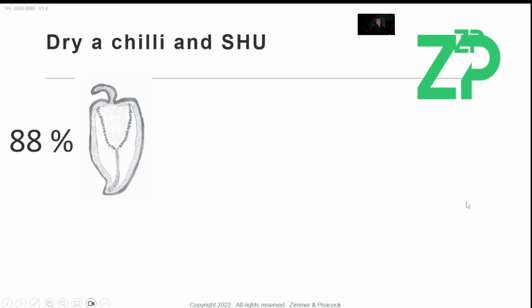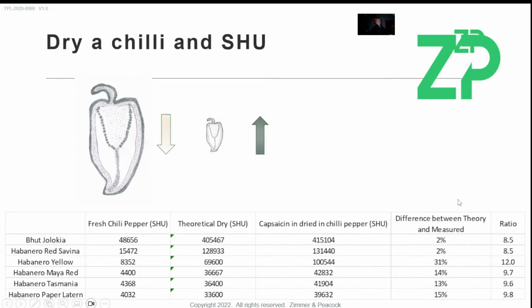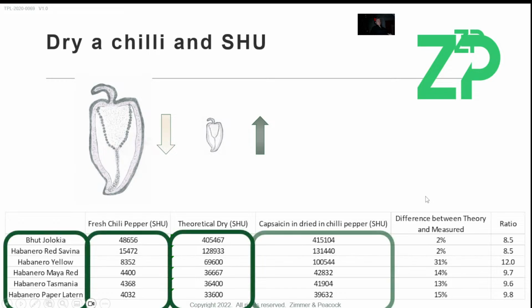When you dry it, all you do really is end up concentrating that hotness. The nice thing about the FoodSense is we're able to follow processes. So if you follow a wet fruit, you may find that it's got an overall Scoville Heat Unit of about 4,300, but by the time you dry it and intensify it, you're getting more like 50,000 Scoville Heat Units. That's because 90% of a chili is actually water.